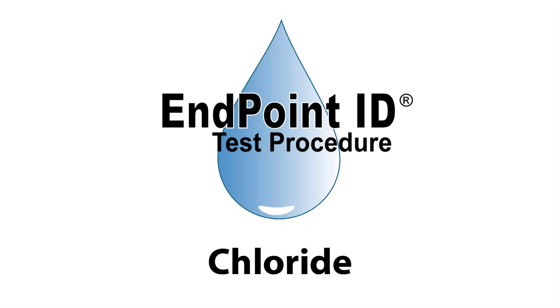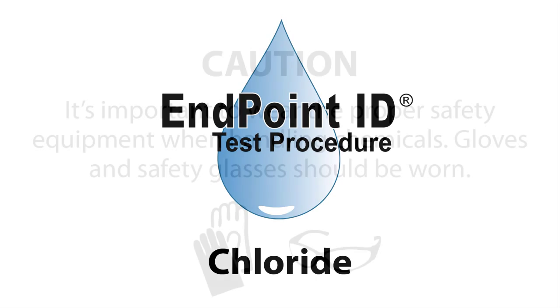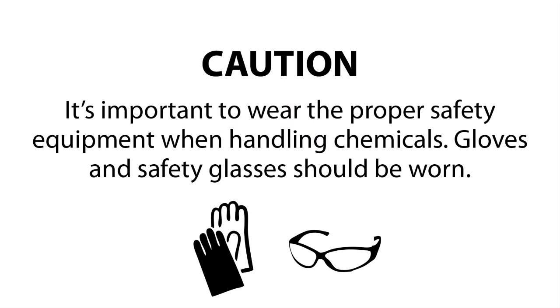This is a demonstration of a chloride drop count test kit using endpoint ID procedures. Any time you are about to handle chemicals, you need to wear the proper safety equipment. Safety glasses and gloves should be worn when performing this test.